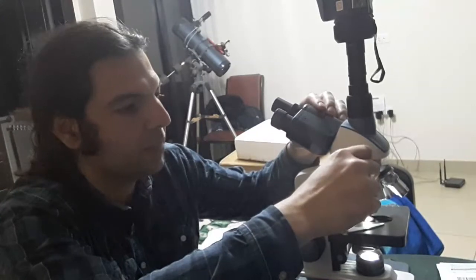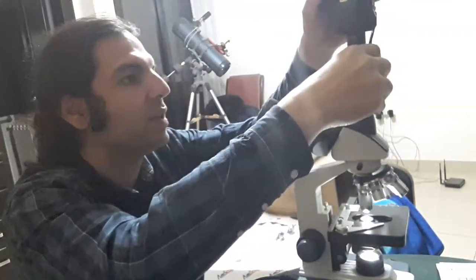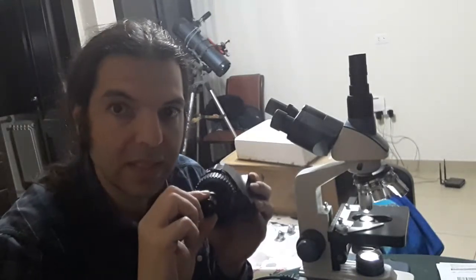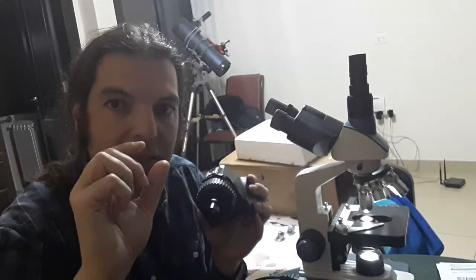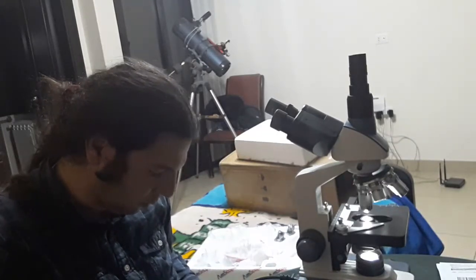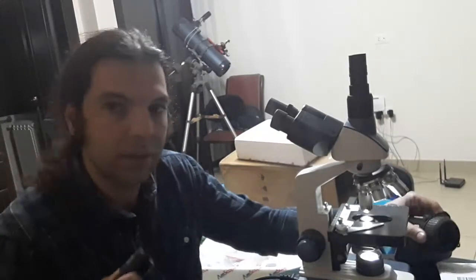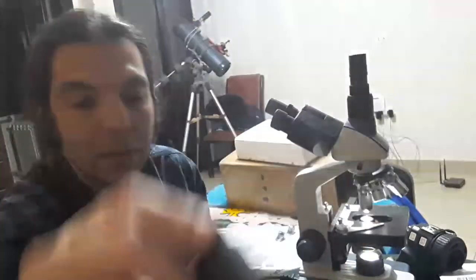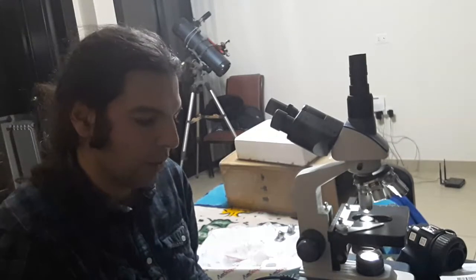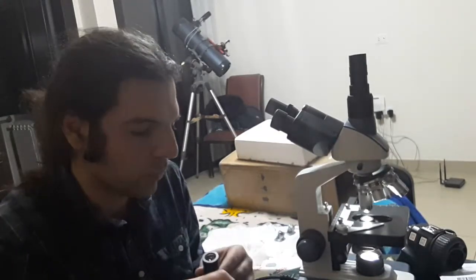The eyepiece can be rotated by unscrewing certain parts. You can place the filter at the bottom. Some of the eyepieces have a little ruler inside the eyepiece itself. There's one eyepiece that has a ruler — I think it's in micrometers — used for measuring specimens.